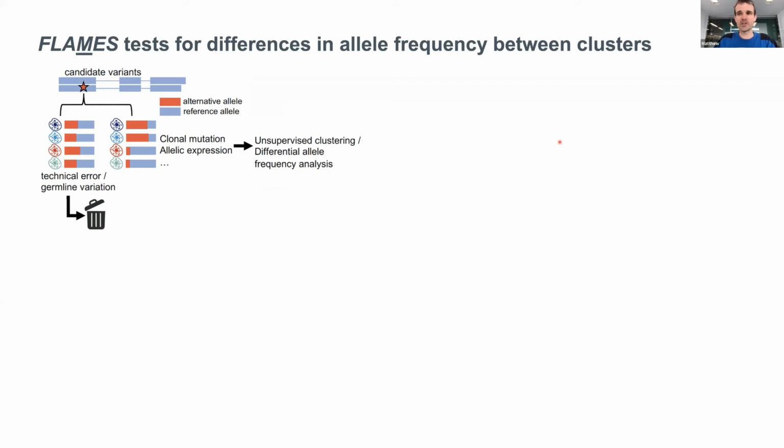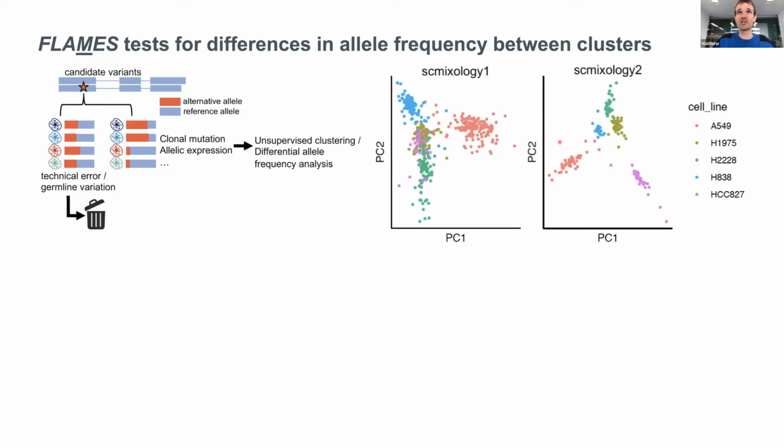So if we do an analysis of those, the first starting point is you could say, well, let's take the allele count matrix for the alternate allele for our cell line mixture data, because those are just 5 different donors. It's not really clonal there, it really is germline, but because we've got different donors in there, it will come out reading like how we might expect an interesting mutation would look in a regular sample.